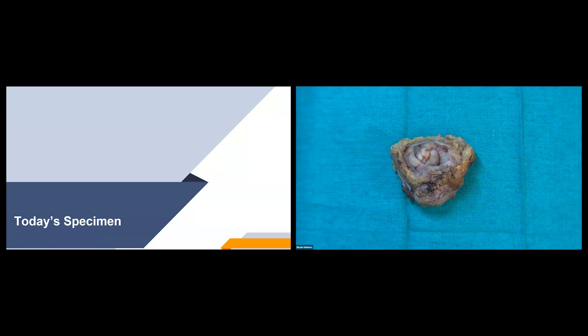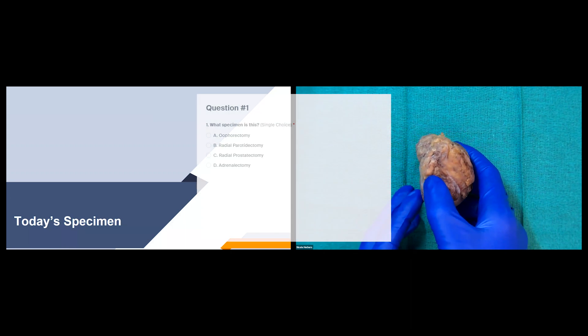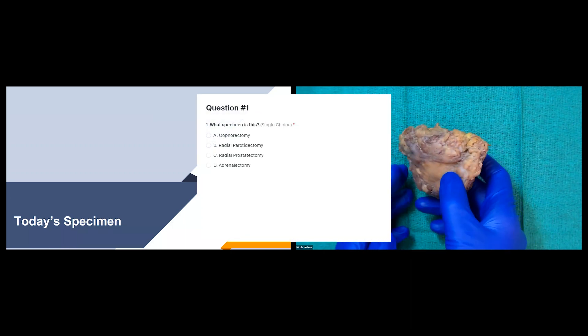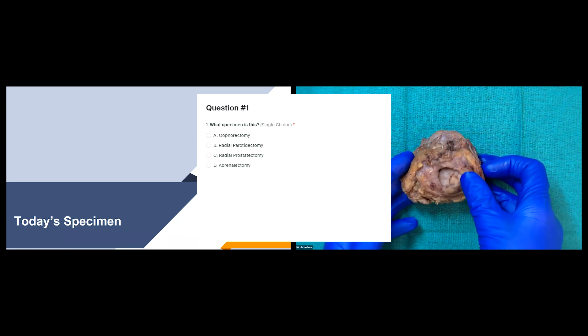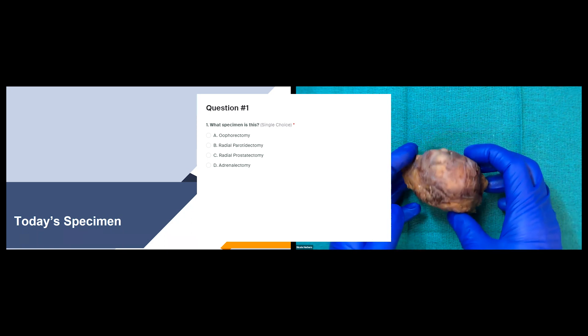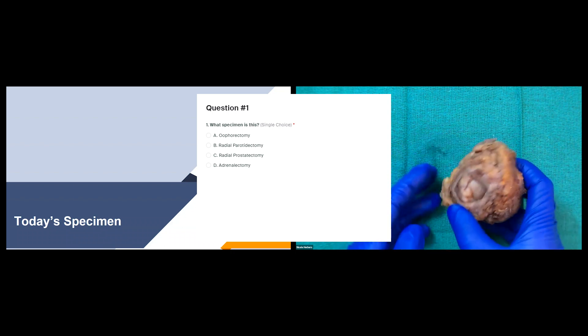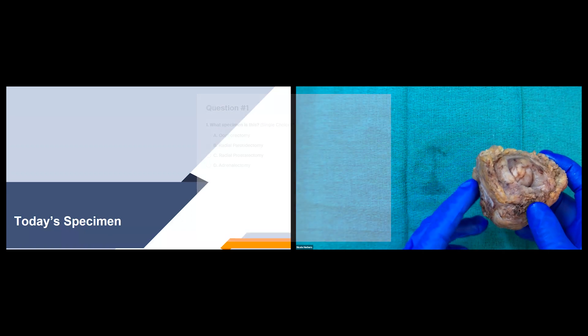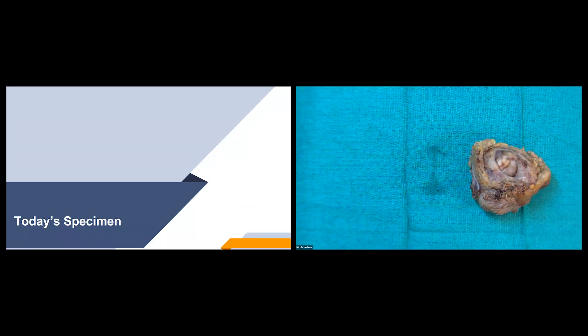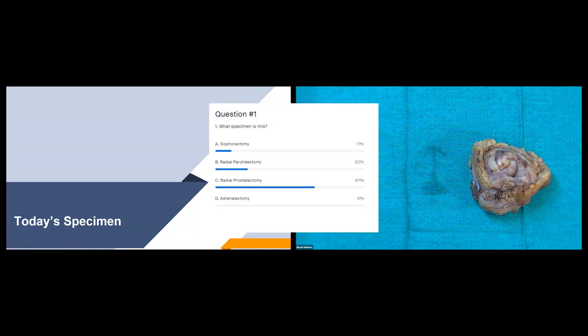Hi everyone, welcome to our grossing rounds. Here is today's specimen. So what specimen is this? It is in fact a radical prostatectomy specimen.